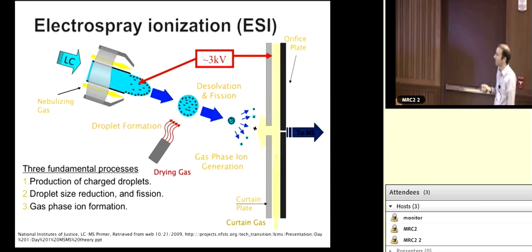And so I'll show you. Steffi will talk more about the chromatography side of things, and I'll be covering this in detail in this talk. So this is an LCMS system. All of those components are here. We've got an LC system, and then we have the ion source where your ions are made, and then the internal parts of the mass spec is where the mass separation happens, and the detector is located inside as well.